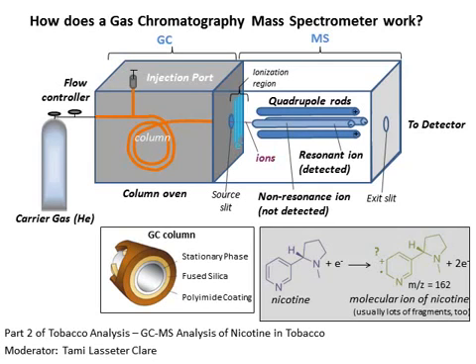It is also possible for the original molecule, or parent molecule as it is often called, to break apart into ionic fragments, which are called daughter ions. The fragments have masses that are less than the original molecule, and they may have a charge of +1 or +2 or some other number, +3 or 4, and so forth. The charge of the ions matters because in mass spectrometry we care about the mass to charge ratio. So it is the mass to charge ratio that determines the flight pattern of each ion through the mass analyzer, which is the quadrupole type in this experiment.